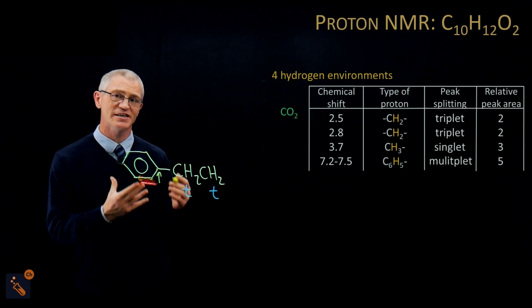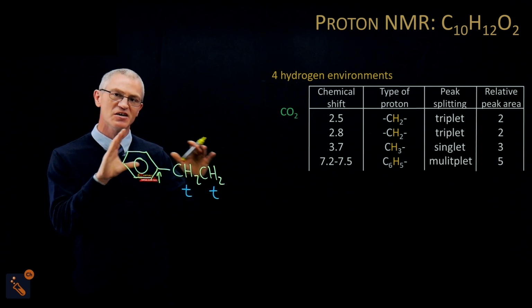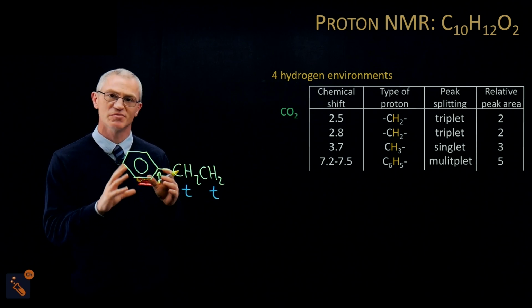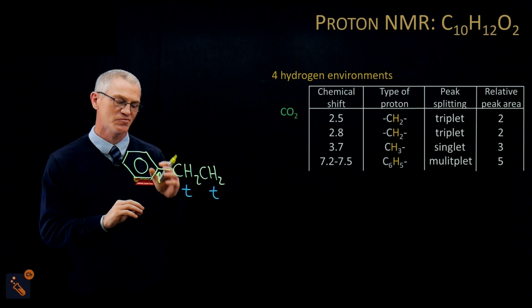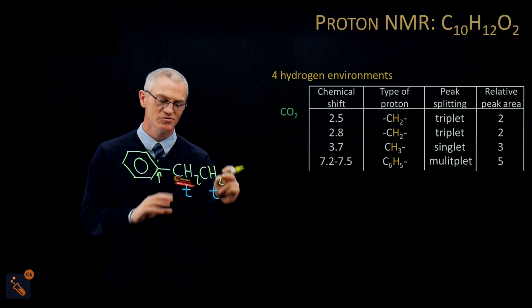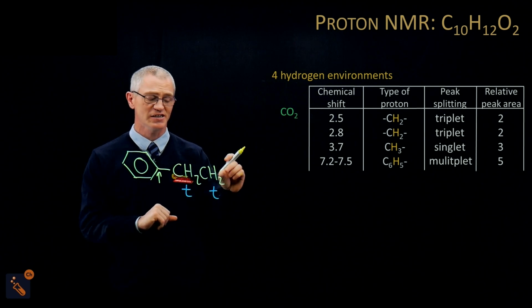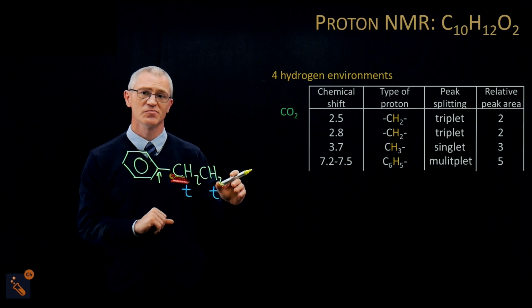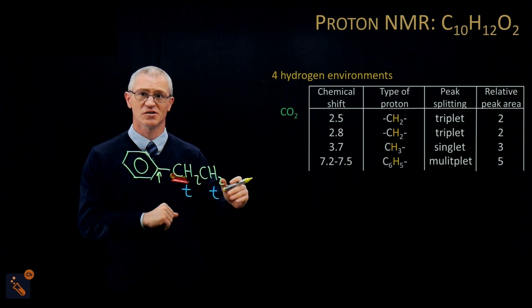And you have to make educated guesses in NMR. So when you're doing it in an exam or doing it as questions, you have to usually make a few guesses first. And that's my first guess. I'm thinking that's got no hydrogen on it, so it makes sense. This side also has to connect to a carbon with no hydrogens on it. Okay? Or an oxygen, for example.